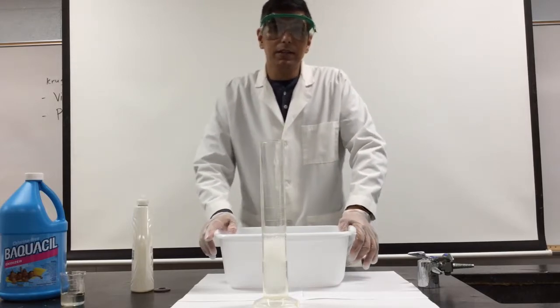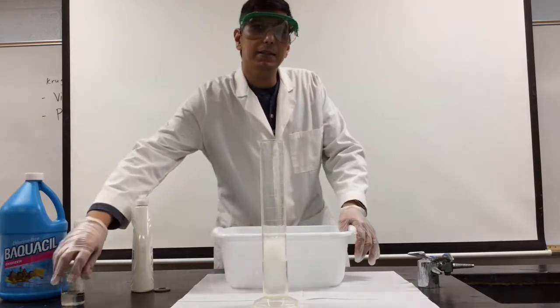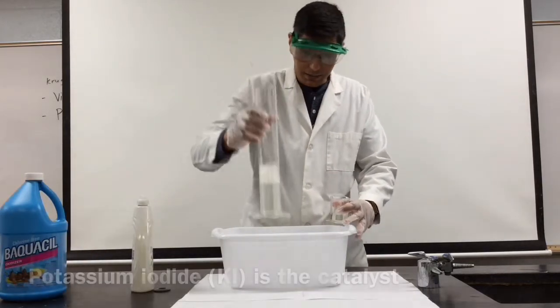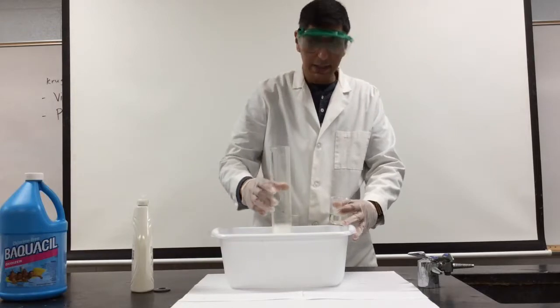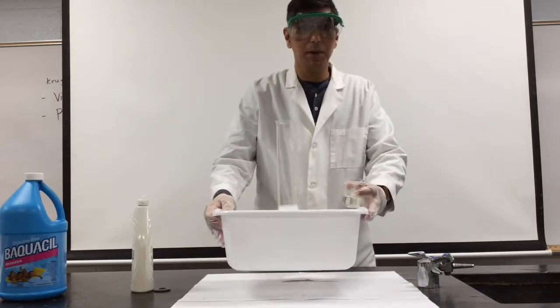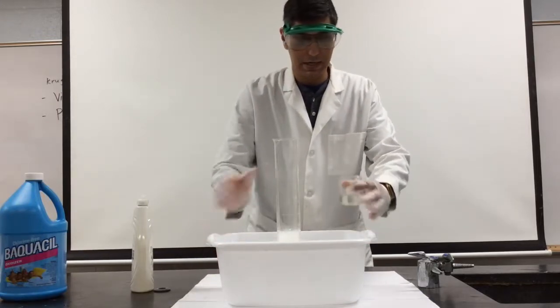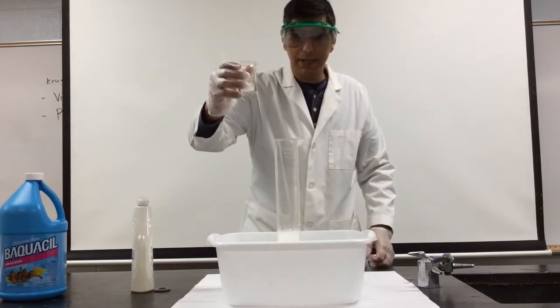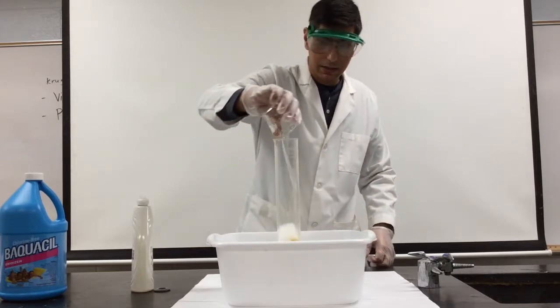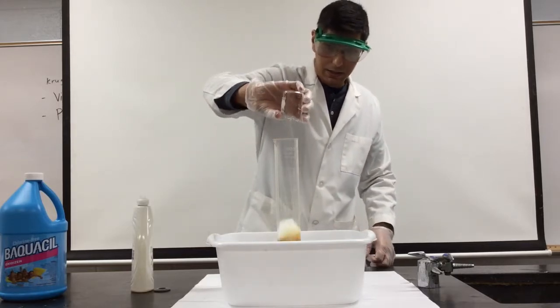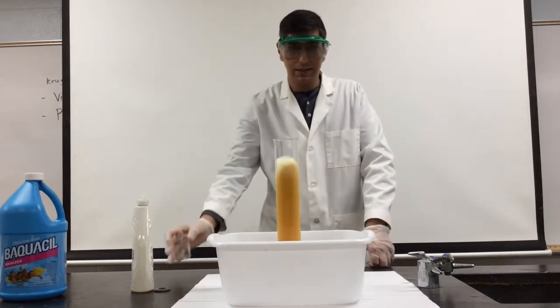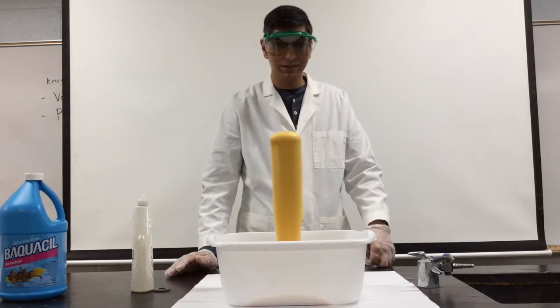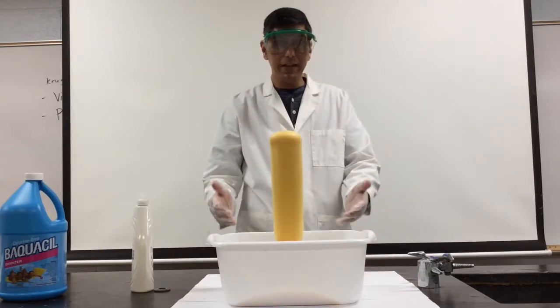The catalyst that I'm going to use is potassium iodide. I'm going to put this into a tub because this might get a little bit messy. Here's the potassium iodide — and that's a catalyst.